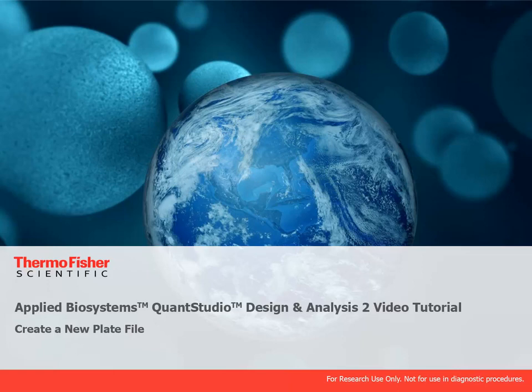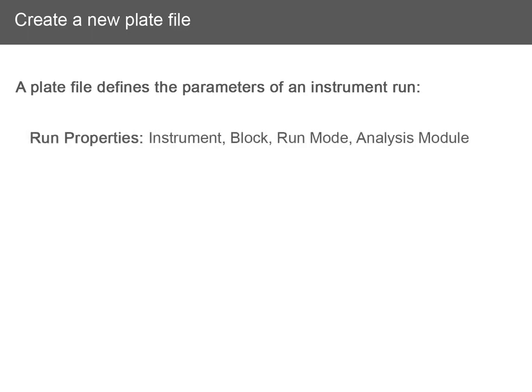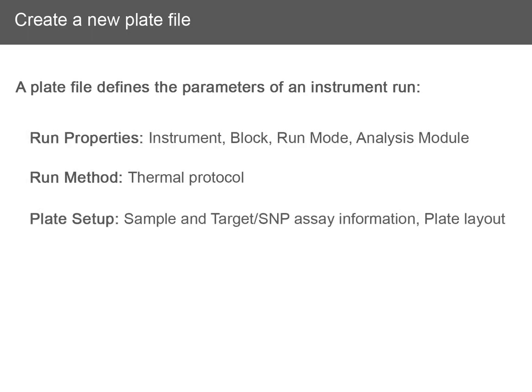In this video, we'll show you how to create a new plate file. A plate file defines the parameters of an instrument run, including the run properties, the run method, and the plate setup information.